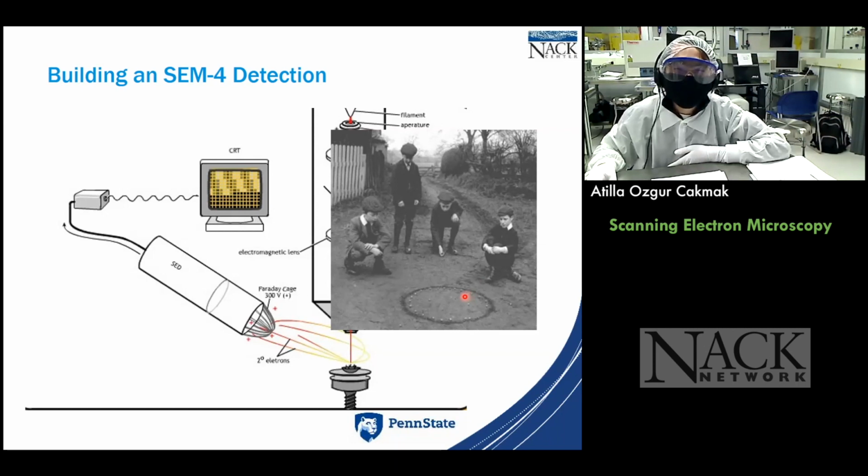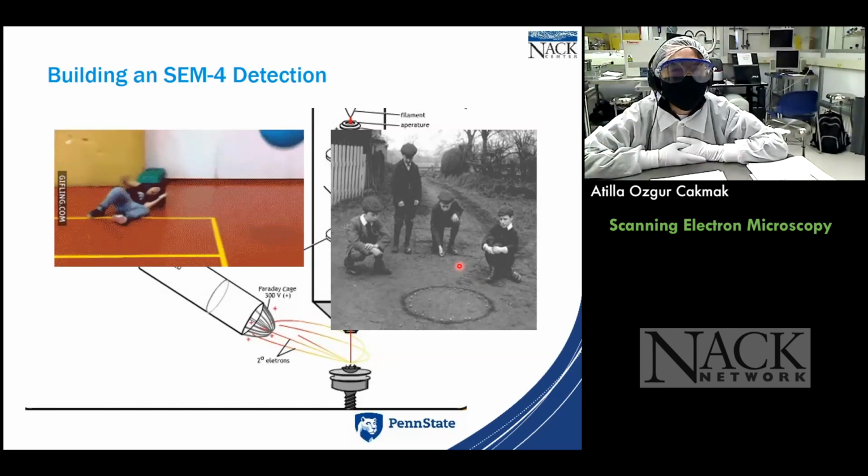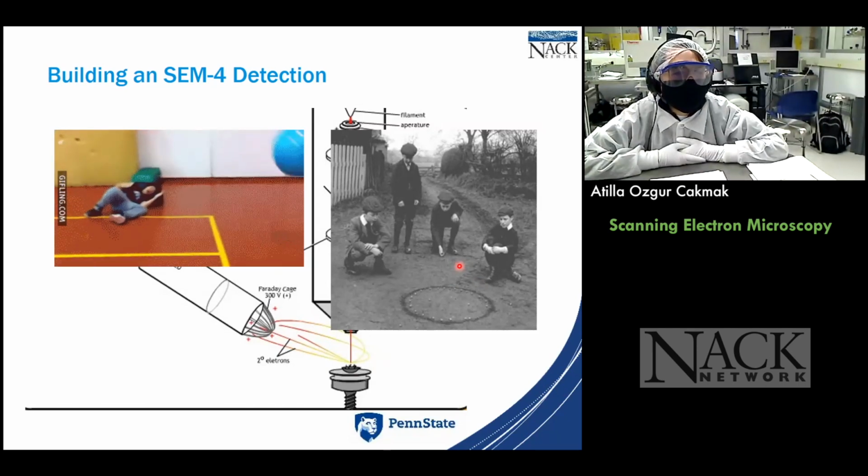So the idea is to get some of those marbles to be deflected and to get into some interaction with the incoming marble. Or this is the other example that I give. So the information that we will gather will be something like this. Let's think of the blue ball as our incoming electron, and the yellow ball is the atom.